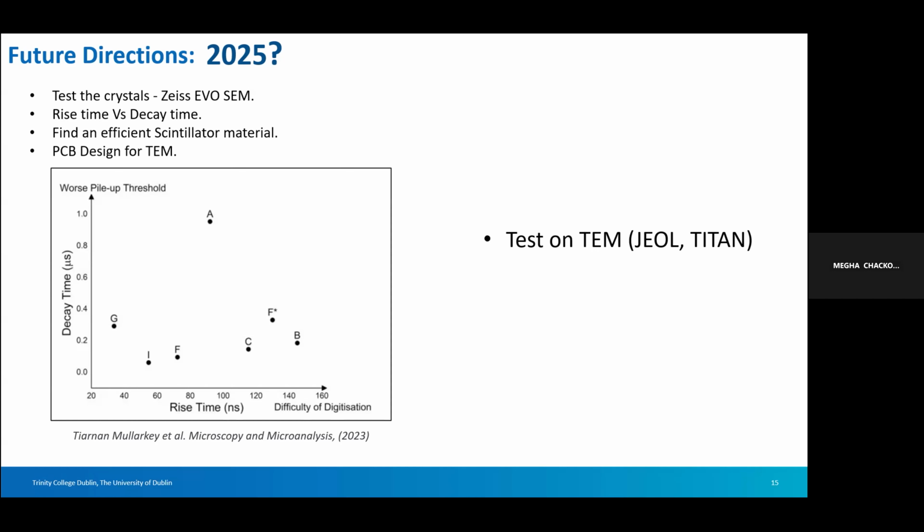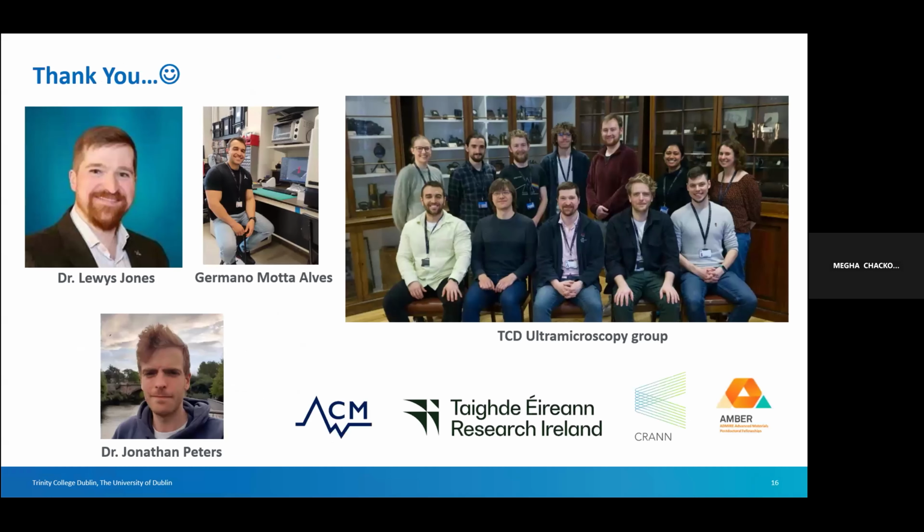In the future, that's the plan. The plan is to test these scintillators on the SEM, check the rise time and decay time, and find an efficient scintillator material. Then make a PCB design that will be good enough to go on the TEM. It should be a compact design; I cannot use the SEM design for the TEM. So I have to make a new PCB design and then test it on the TEM JEOL. Thank you. I would like to thank my supervisors and all other group members who have helped me a lot in this project. Thank you.